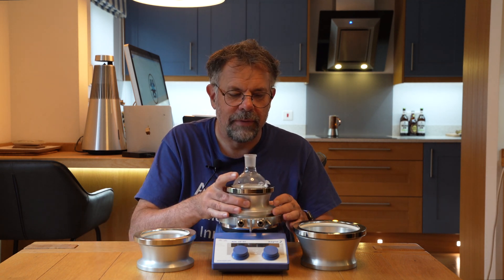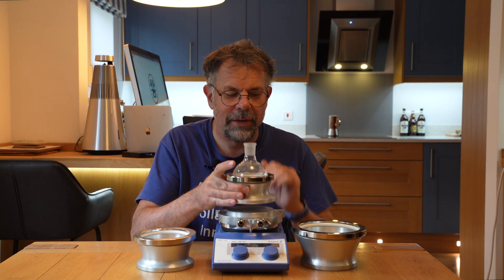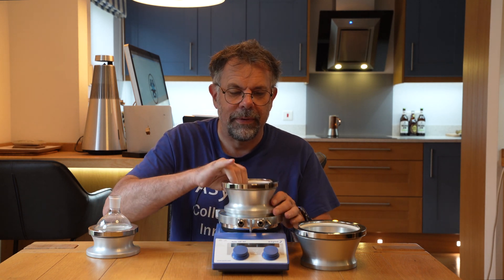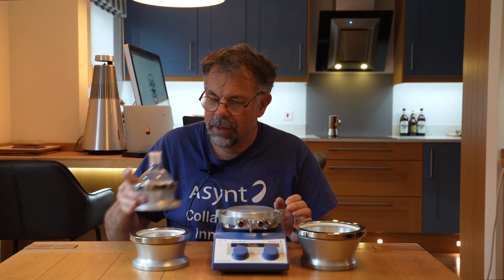Where does Snowstorm come into its own? Well, unlike when you have a jacketed reactor vessel, changing sizes and scales can be quite laborious. But with Snowstorm 1 you simply swap around the bottom flasks, and changing scale is as simple as that — very, very easy. There's no connection directly to the thermofluid; just simple heat or cooling transfer through the aluminium.